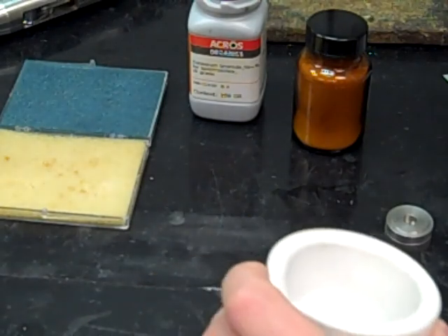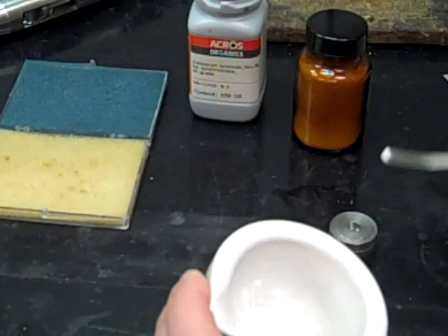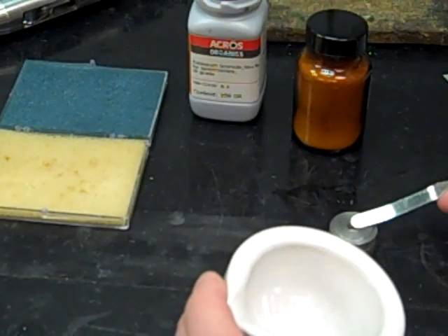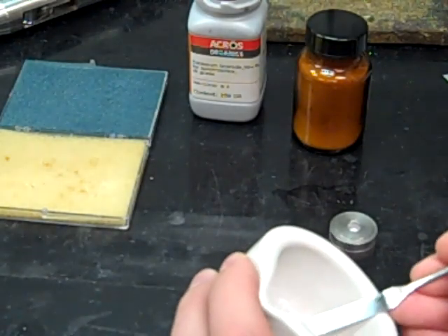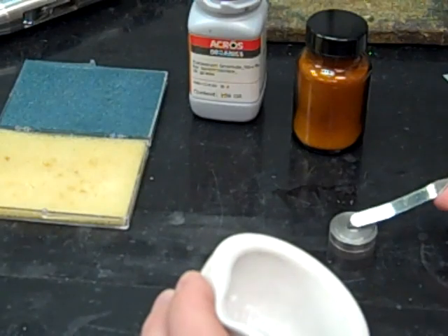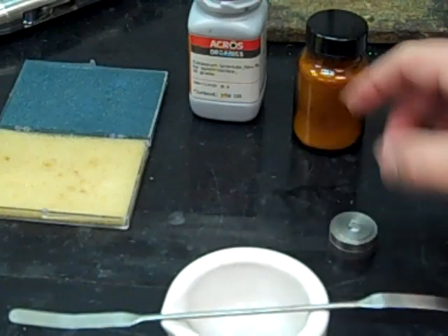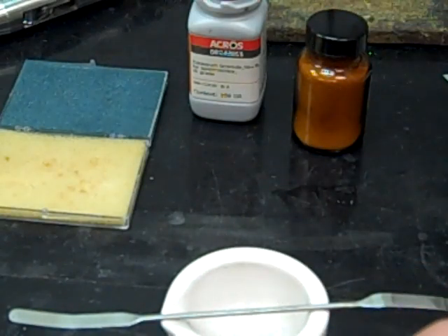I'm going to load in just enough sample to give a thin layer covering the surface of the metal. And this is usually the toughest part to get right. Having too much in there is going to make a pellet that's too thick. Having too little is going to make a pellet that won't hold up when you press it.